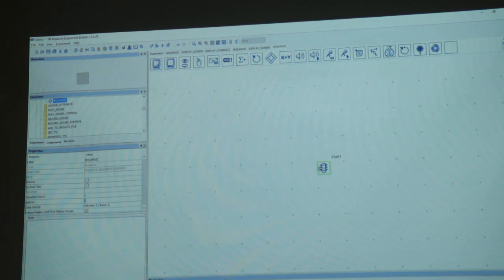So a data source can be any CSV file, preferably a text file. The easiest way is to make it in Excel or any tabular format and export it as text. You can make it in whatever file you feel comfortable with. When you are incorporating it here, there is an export option, and you just convert it to text at that time. And for the position of the queue where it is going to come.